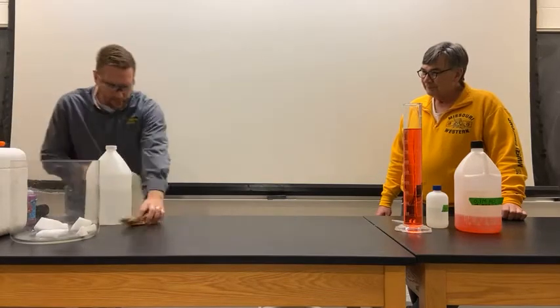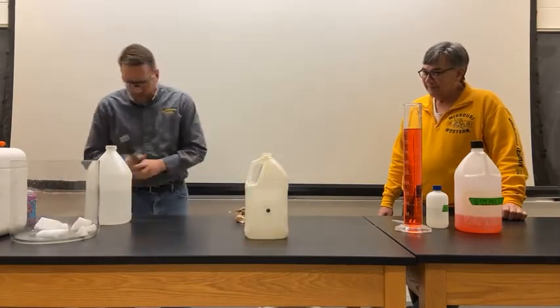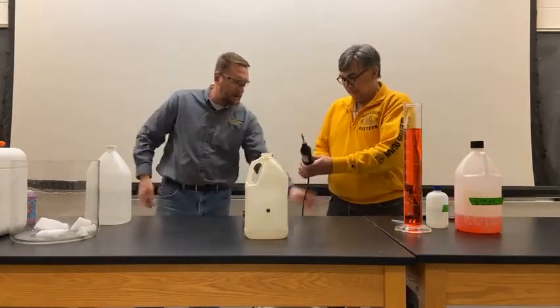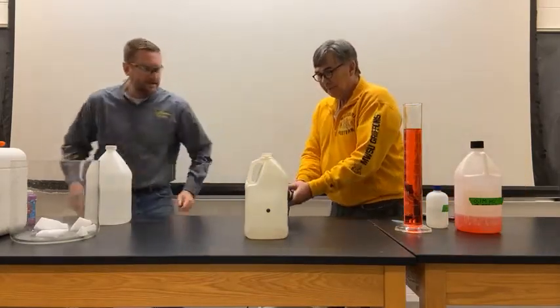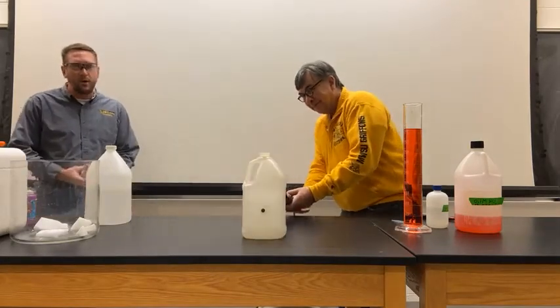All right, so we'll do this big one here. Okay, I'll make sure that all of the ethanol is out. All right, so will Dr. Clapp do this one? There we go. Just turn the bottom there. Turn it up till you hear it buzz. Okay, here we go. This is a little bit bigger. Woo! Yeah.